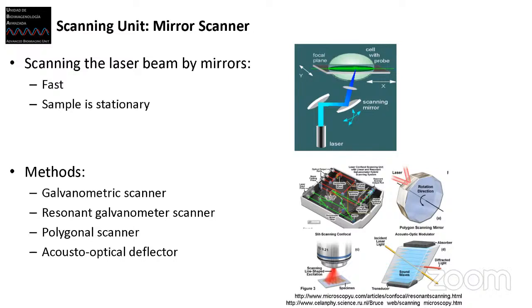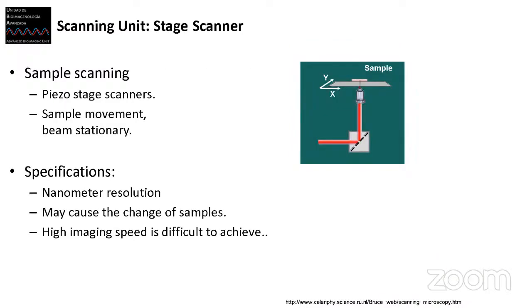You can change how the light passes through this optical object, and basically do this in a certain way. You can even use this to scan. We use it most of the time to attenuate our lasers, but we will see in the DIVER, because it's open, so we can look part by part at what they are doing.